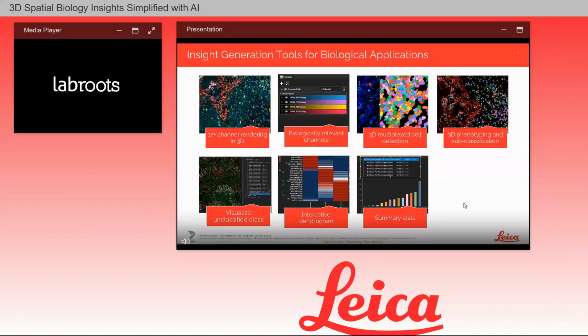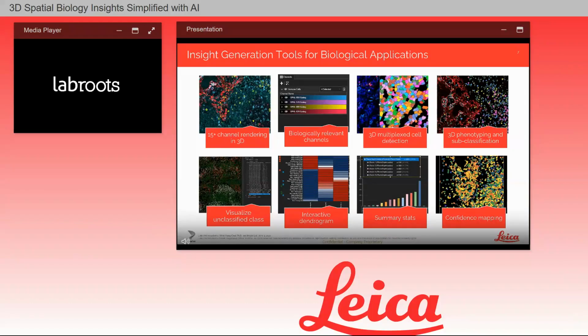Lastly, users can be empowered to make informed decisions about phenotyped cells by utilizing confidence mapping. When Aivia does phenotyping, every mesh object or outline object is given a confidence value. That's essentially to sum up how confident Aivia is in that cell's membership in that particular class. There's a preset threshold we have for objects to be classified into a particular class. Users can leverage this confidence value for additional analysis, for example, for quality control for low confidence objects to be removed or retrained, or for high confidence objects to be chosen for further analysis.